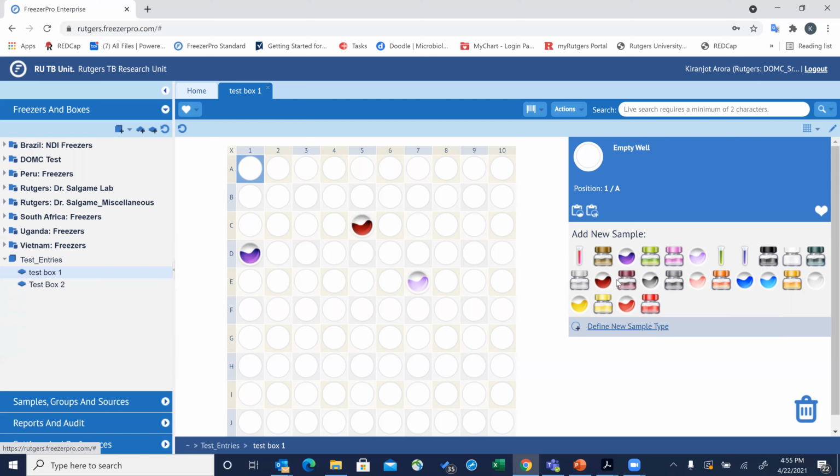All right. And another thing is all of these samples are organized alphabetically based on their name. So, the first one is dried blood spot for NOD. Then comes the gastric aspirate palate for NOD. These ones from here, MTB isolate for FEND-TB adult till here, which is NTM isolate nasopharyngeal aspirate for NOD PED study. All of these are basically different isolate sample types.